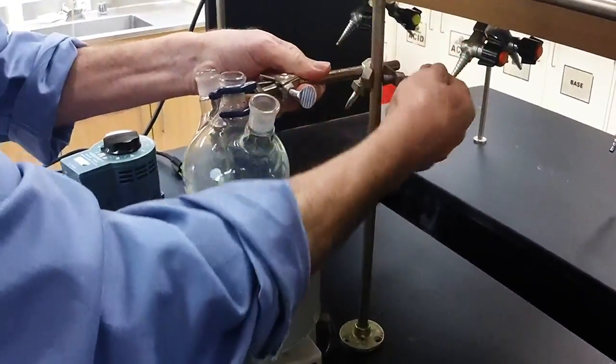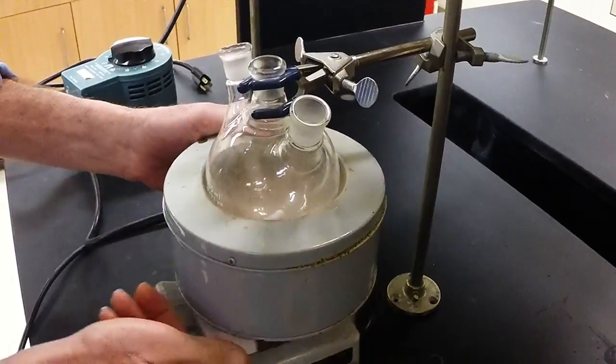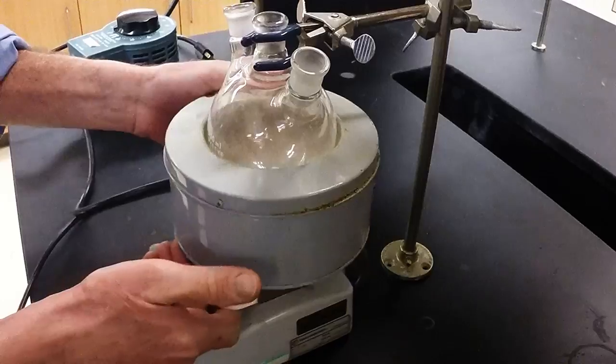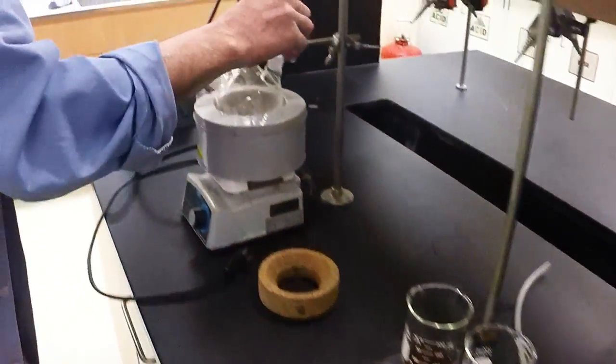So we're going to drop this down and get it in the middle. A little bit of wiggle room — just enough wiggle room that we can get that off if we need to in an emergency. And I'm going to need a stopper.